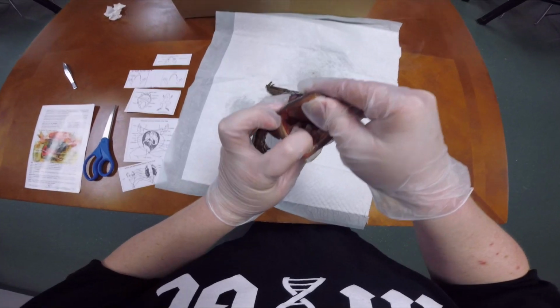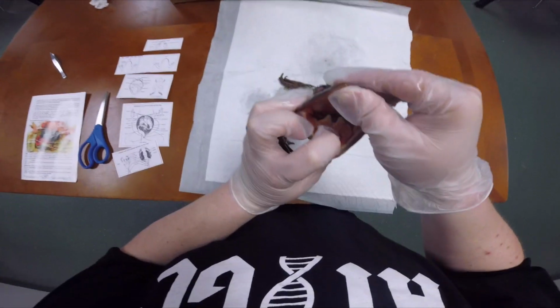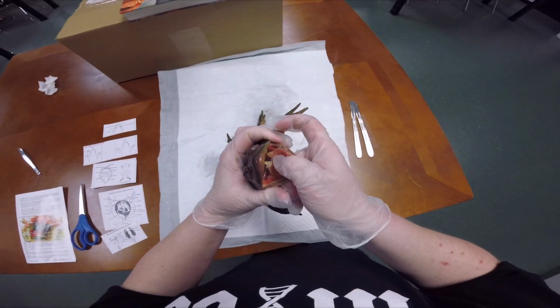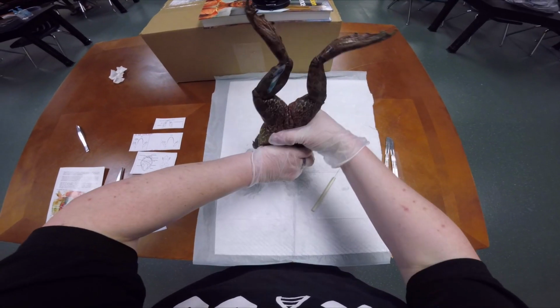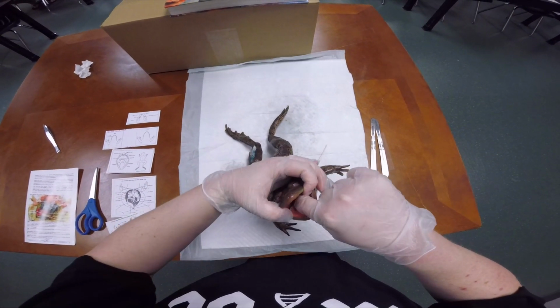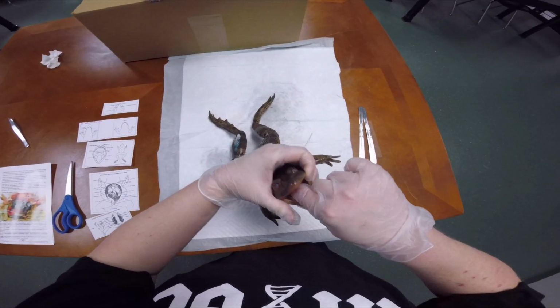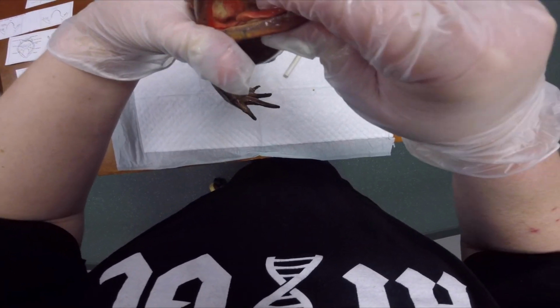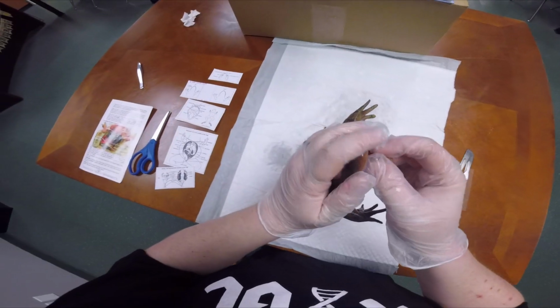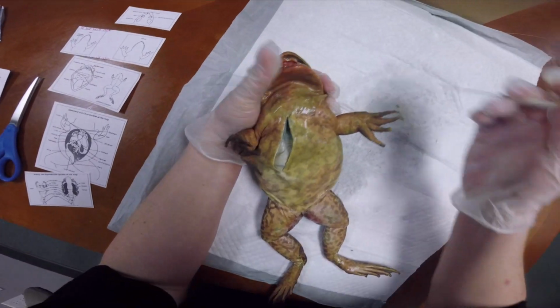When you look into the mouth, you'll be able to see the glottis, maybe. I'm having trouble seeing it because it's so closed, and you would be able to see the esophagus back there. The glottis is going to be back in the throat with the esophagus, so that's going to be kind of hard to see. And then the pharynx is in there as well. This is quite a difficult frog to get its mouth open. So what I do want to show you, aside from the tongue, is the top part of the frog.